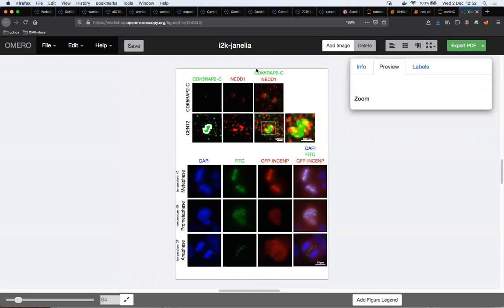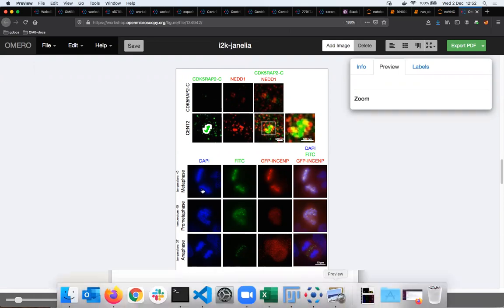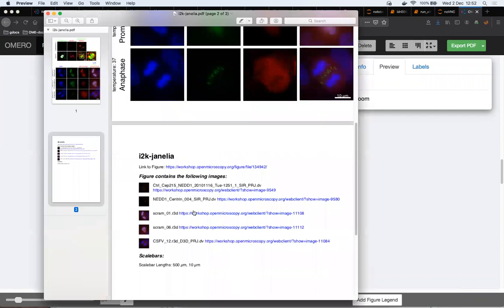So I can click on it in this PDF, and because I am logged into OMERO, I'm jumping directly to that figure in my browser. Secondly, typically, when you send something to a scientific journal, the process can be quite long, and then they come back to you and say that you need to change panel B on figure 7, and you don't know anymore what the original raw data underlying panel B in figure 7 are.